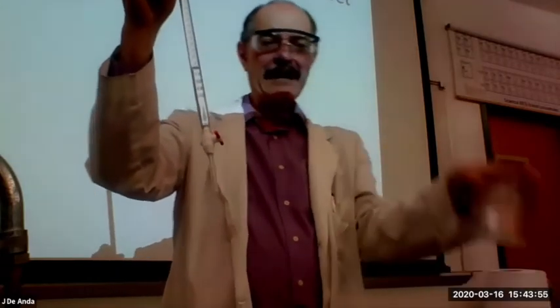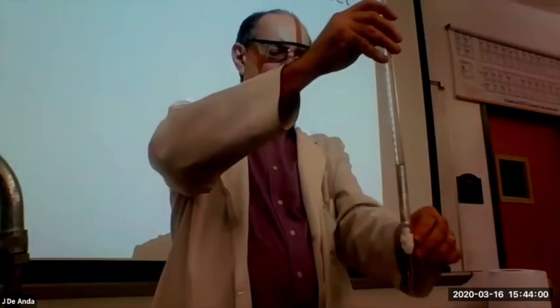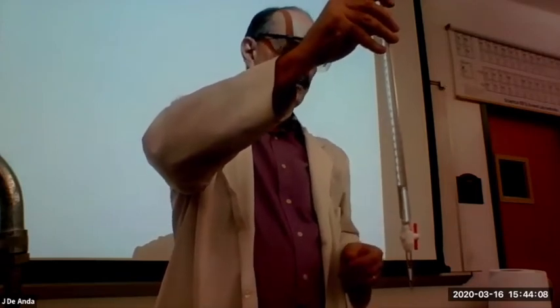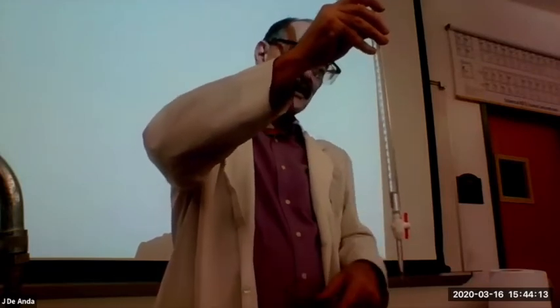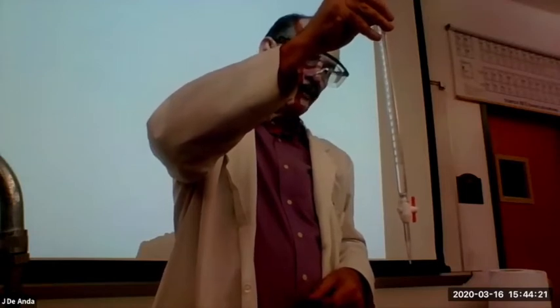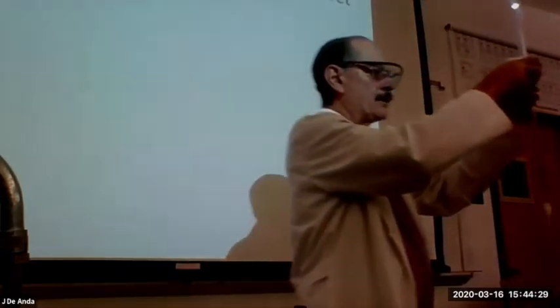And then bring it back. You should have a beaker for waste, and just let it empty into that. That way the tip of the burette will also clear out and get conditioned. I think the protocol maybe tells you to do this twice, but I think one time should be enough. This also allows you to check that it's flowing well, okay? And then let it flow all the way out, and once it's out, close the valve, and bring it back to your stand, all right?